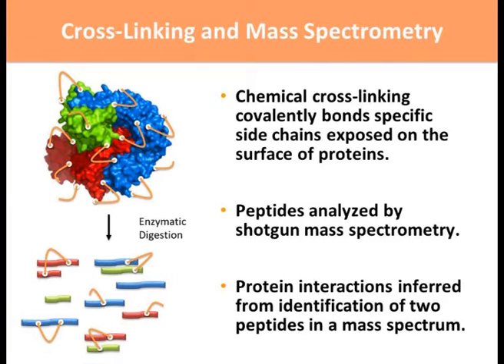Now, the other component that Mike has been doing is working on how does someone actually take a protein complex now and work out that spatial interaction between each other. And we do this by chemical cross-linking. This is just an artistic depiction here. So this is really a crystal structure or a protein structure of three separate proteins bound together. And these are these little tether points where cross-links can be put onto those proteins where you have a free amine, such as a lysine.